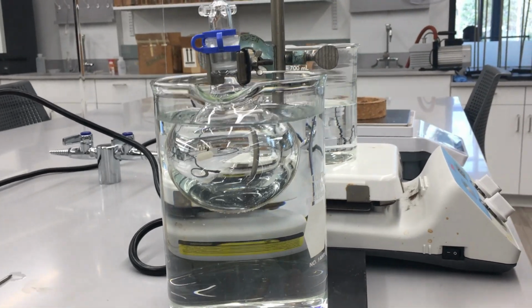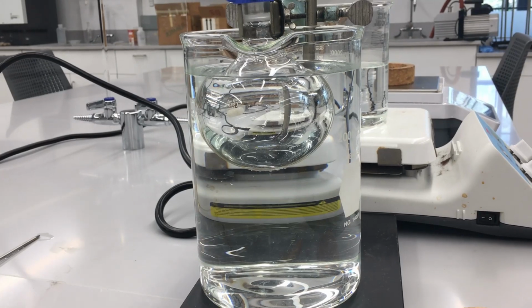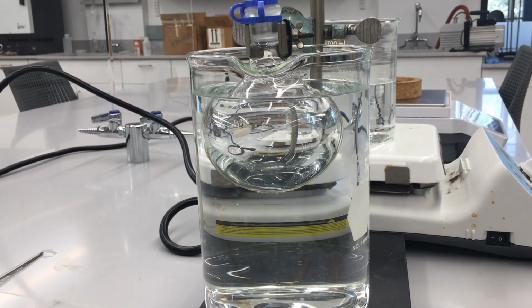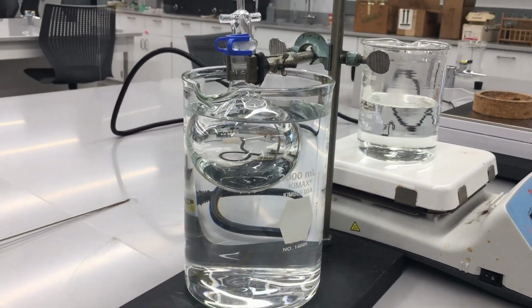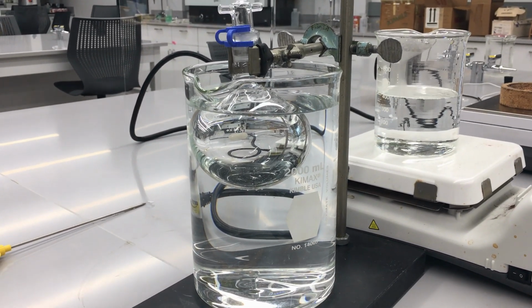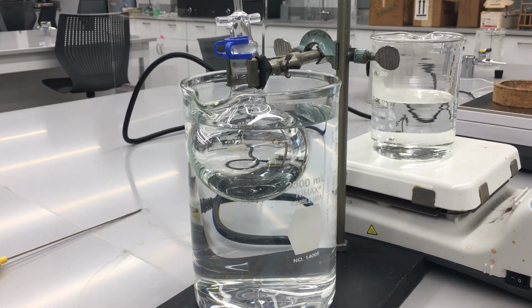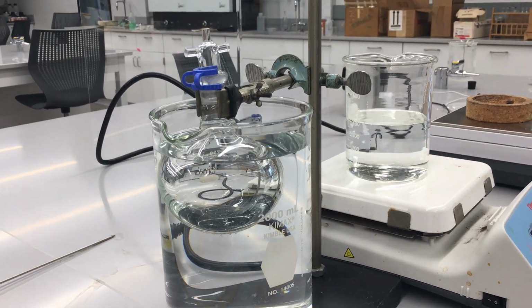So to speed up the cooling process, I'm going to pour some cold water around that round bottom flask just to make sure that I can cool off the entirety of the glass surface. We can see a little pool of liquid beginning to form at the bottom of that round bottom flask. And that is the gaseous vapors being condensed into a liquid.